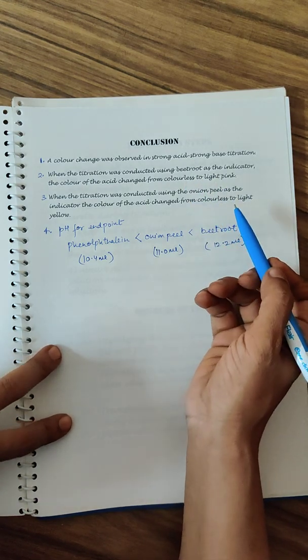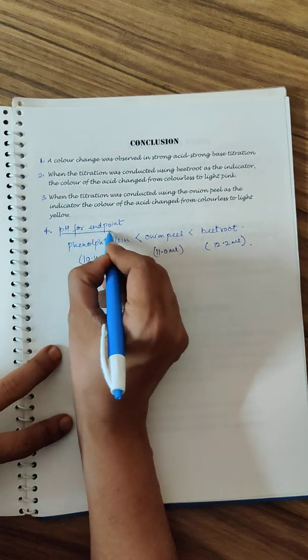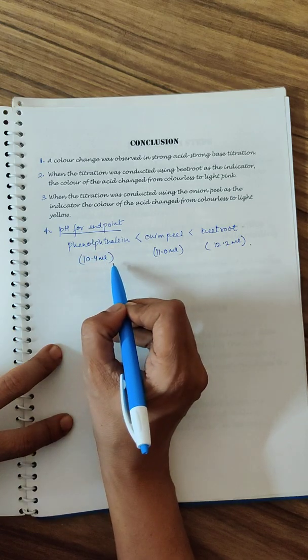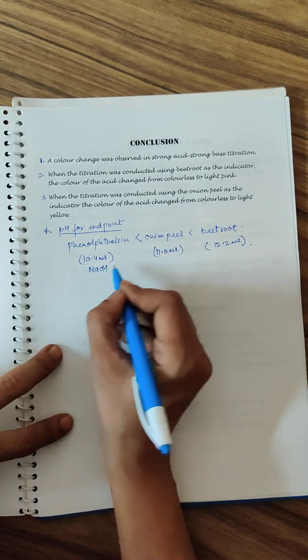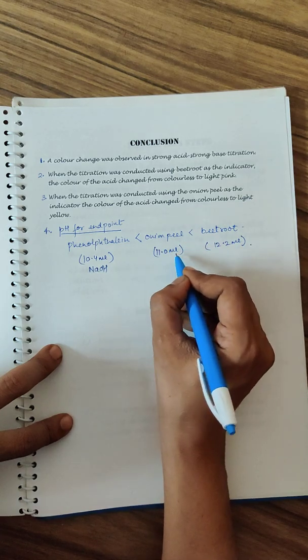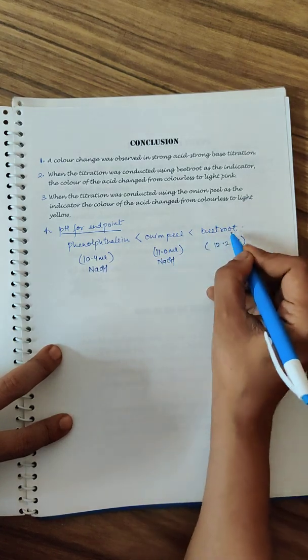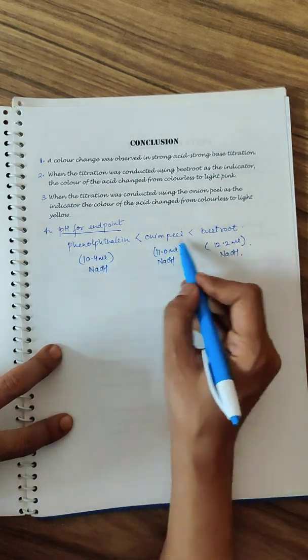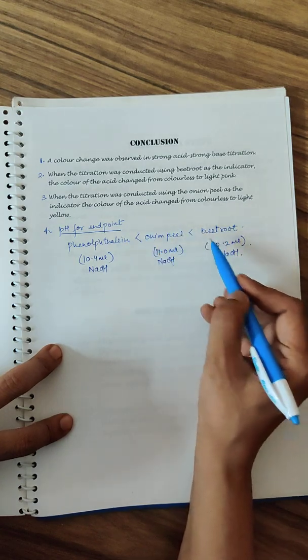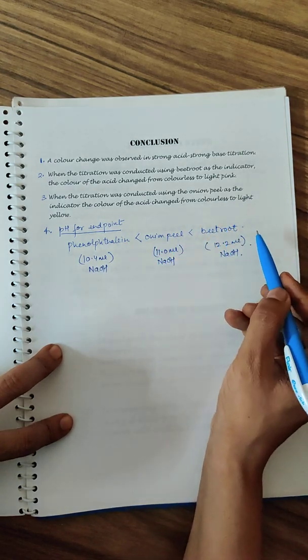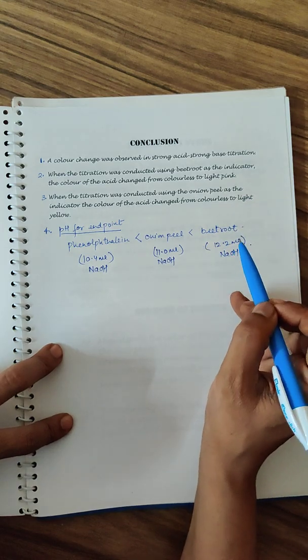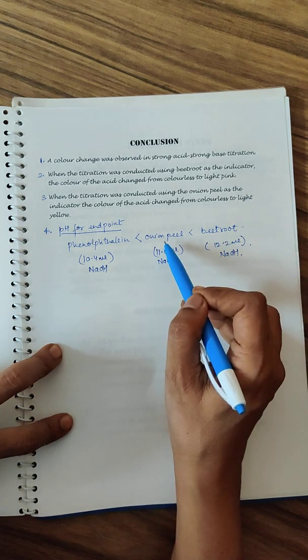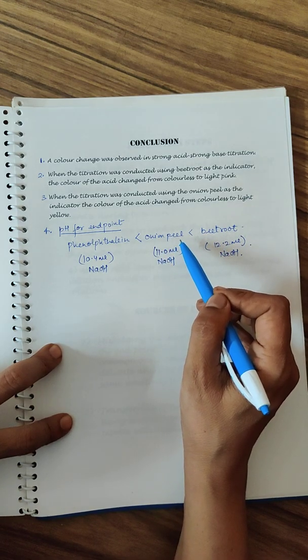Finally, the most important thing is the pH. For phenolphthalein the color changed at 10.4 ml of NaOH. Onion peel it changed at 11.0 ml of NaOH. Beetroot it showed a color change at 12.2 ml of NaOH. This means color change was shown at a higher amount of base, at a higher pH. Beetroot shows the color change at a higher pH. pH closer to phenolphthalein, as compared to beetroot, onion peel can still be preferred.